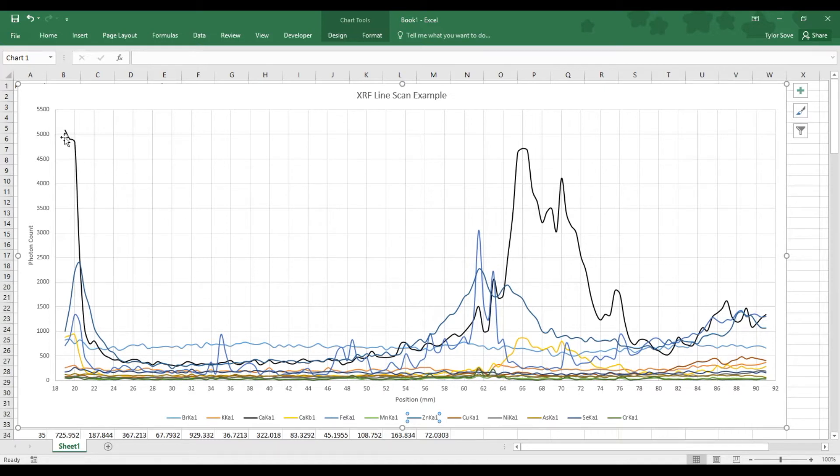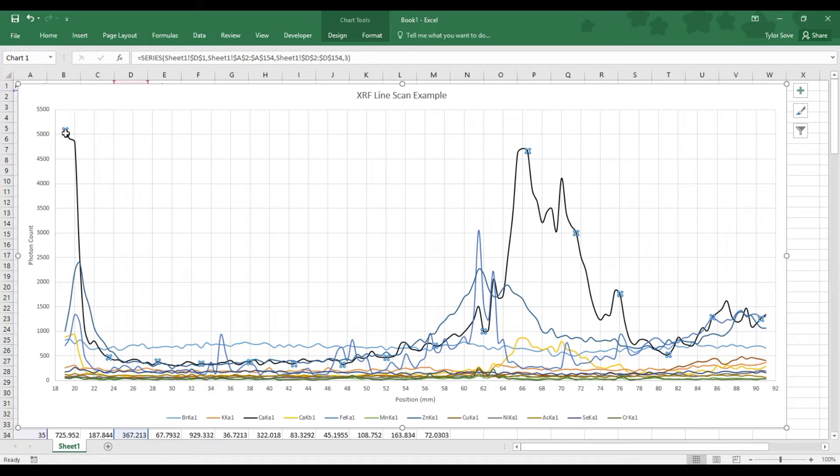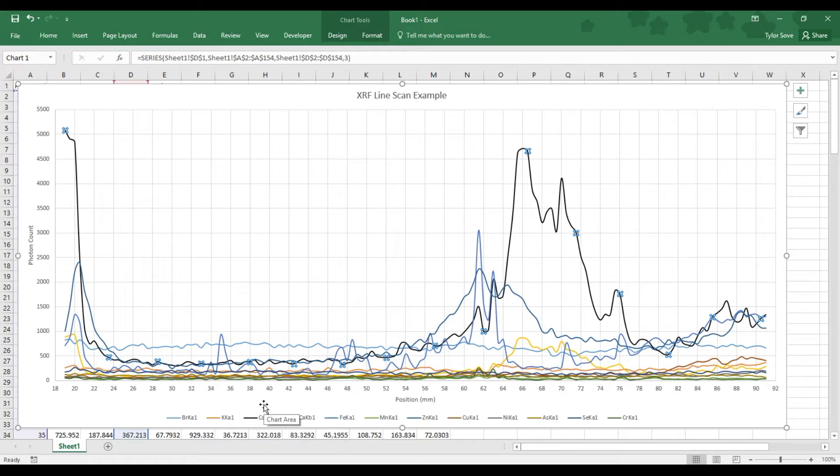This first line at the far left, the tallest one here, is black. By looking down here along the bottom, I can see that the legend indicates this is the calcium K-alpha transition that has been detected.